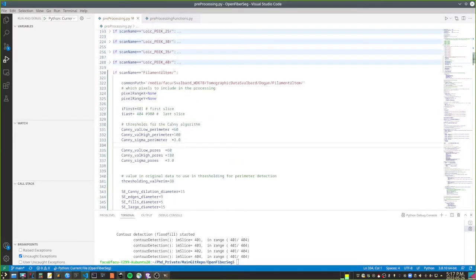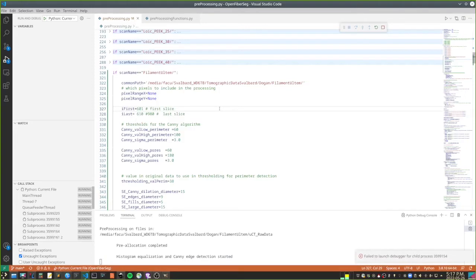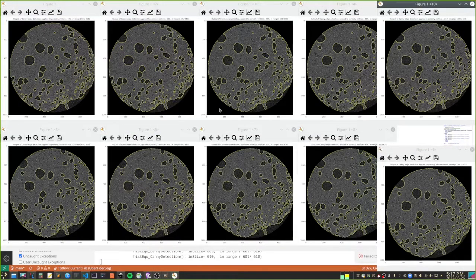So we can try and see somewhere else in the data, say at 600 to 610. Let's do a few more just to corroborate that the parameters are going to be stable across the data set.